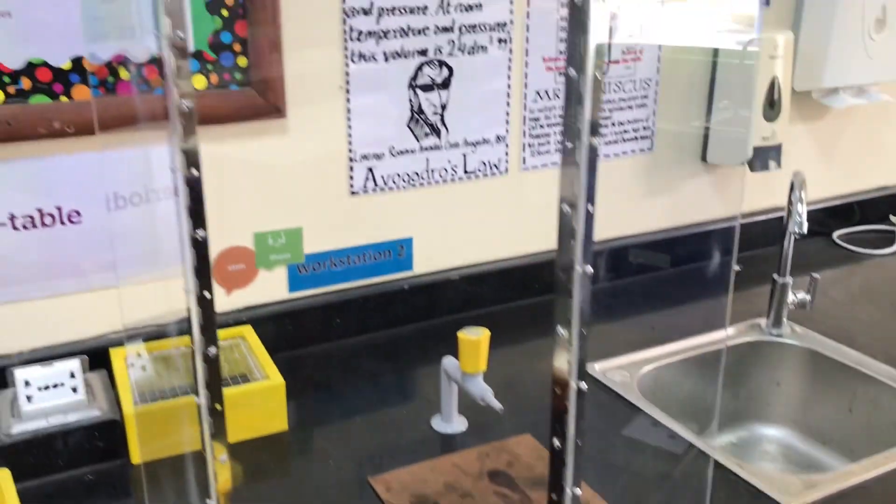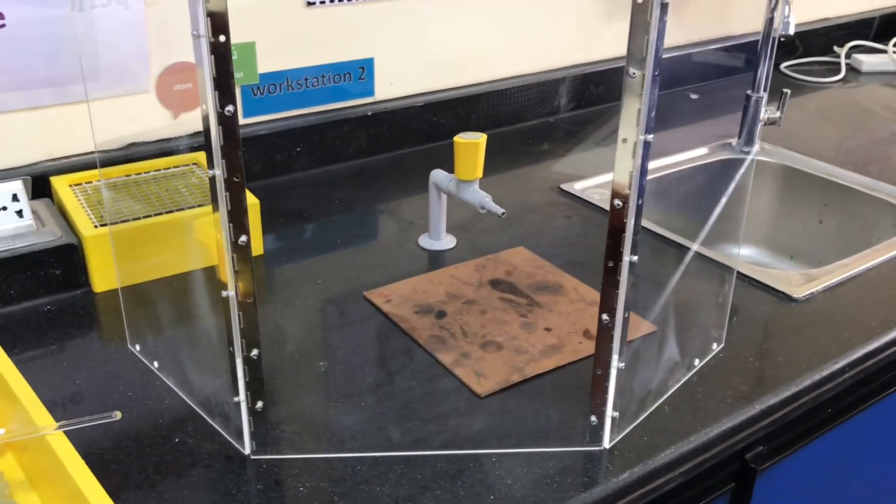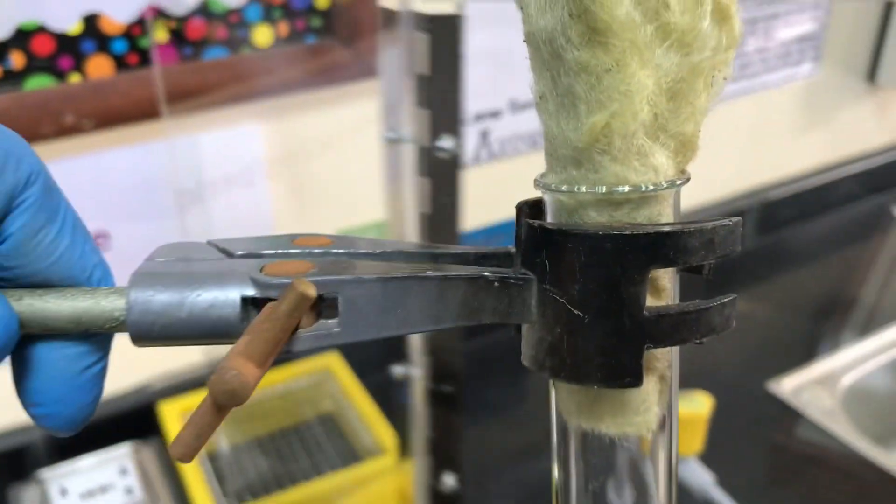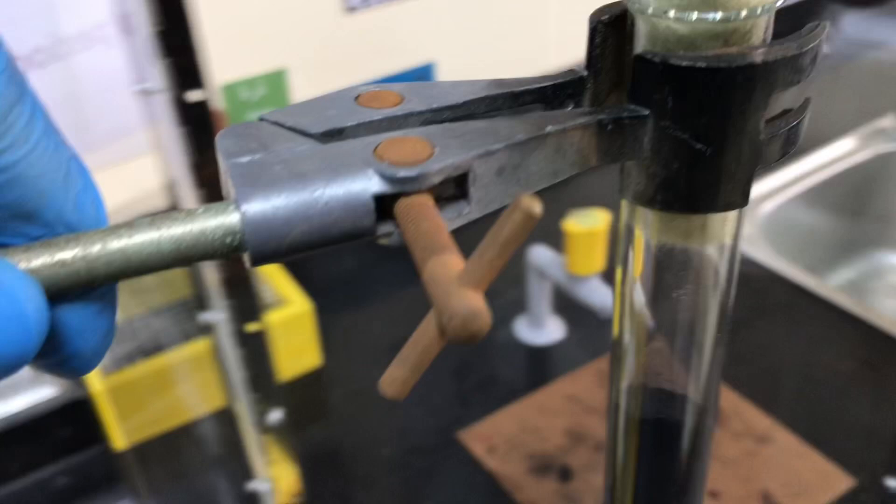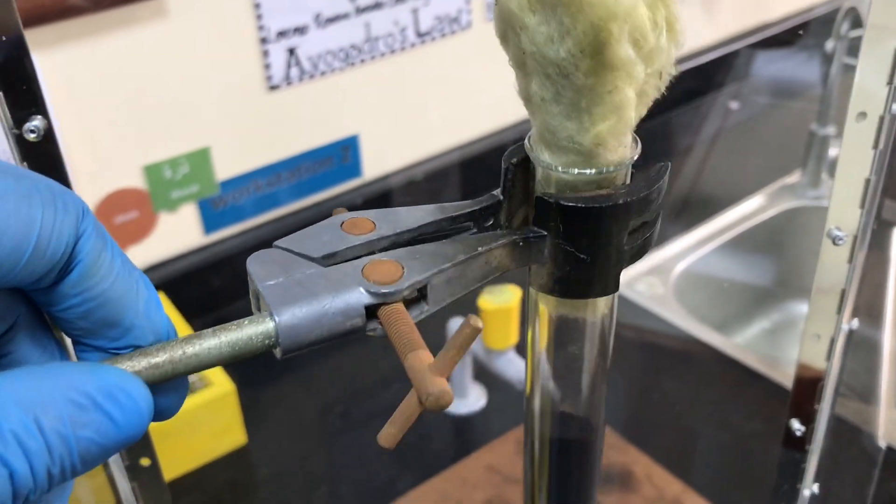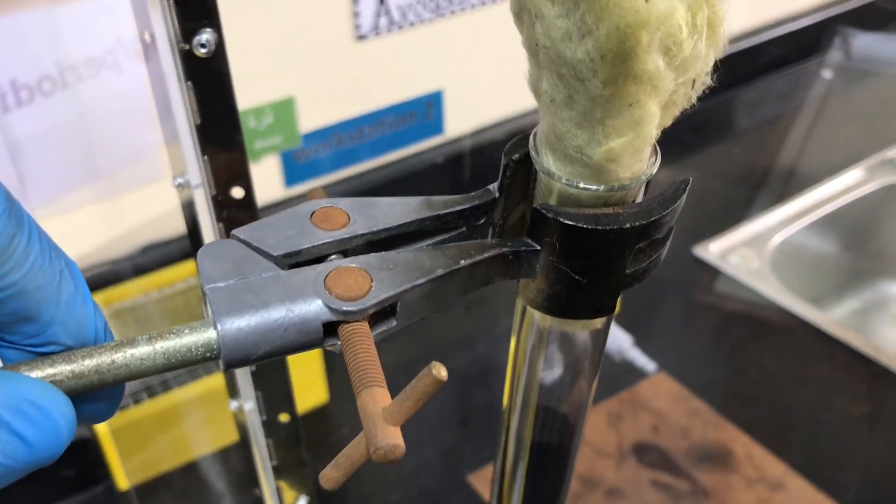So here we are with the safety screen. Beautiful brand new safety screen that we've got this year and we're ready to set everything up. So have your audience on this side. So here we go and here's another adaptation that you can do. Instead of using a pair of test tube holders which will work with the boiling tube sometimes I find that you don't actually get that much of a grip particularly if you want to try and shake it around.